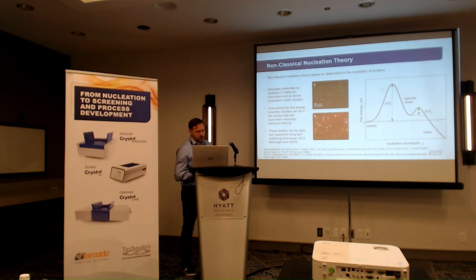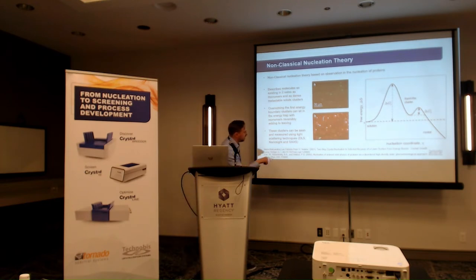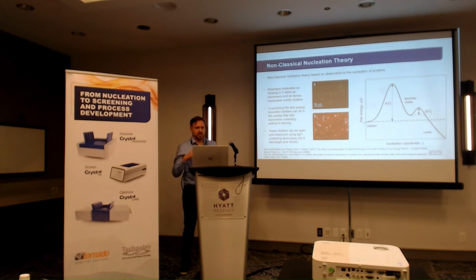The good thing about this one is you can actually physically see these. These are taken on a NanoSight. What you're doing is essentially shining a laser light through a sample, and these can be supersaturated or even saturated. The light then refracts, it scatters off these more dense clusters. If you can see, there might be some slight haloing, and that's the hydrodynamic radius of these clusters that exists around the center. These can also be measured by DLS.